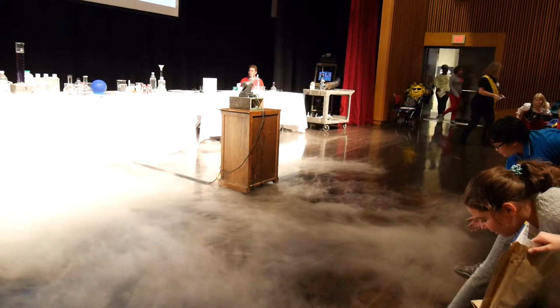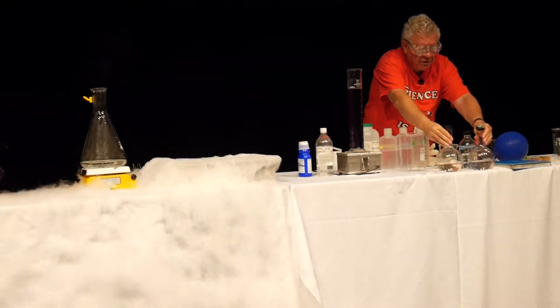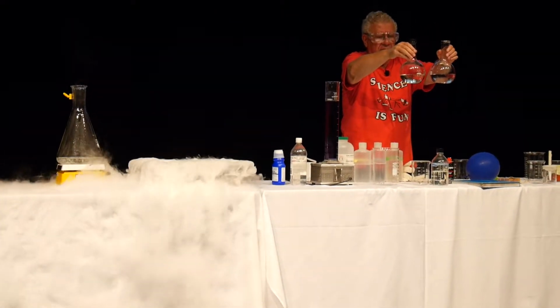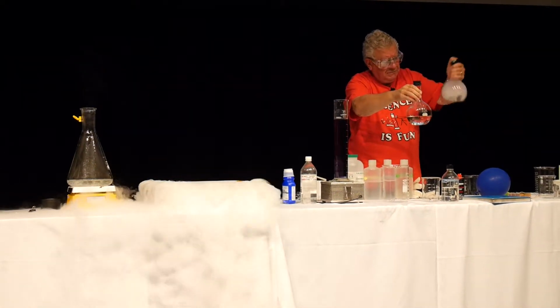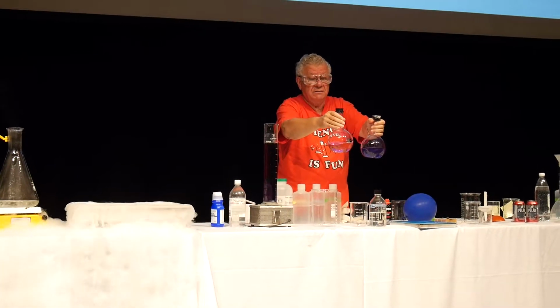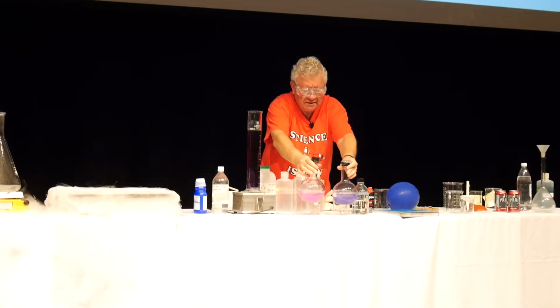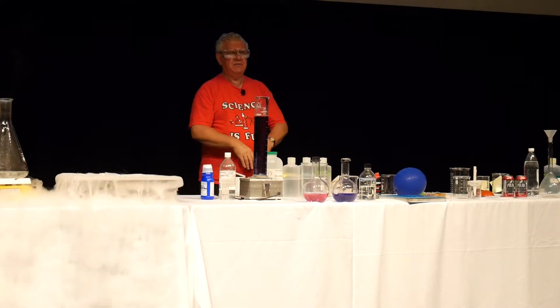All right, so we've seen some color changes so far. Let's do another experiment. This experiment I want to do with these two flasks. I'm going to hold these flasks, and you can see that they have in them about the same amount of a clear and colorless liquid. I'm going to take the one in my left hand, and I'm going to shake it. You see a color change? I'm going to take the one in my right hand and just give it a little shake. You see a different color change. So these color changes, let's see if I can shake them both real hard. And we set this down and watch to see if there's any more change in color as reactions take place.